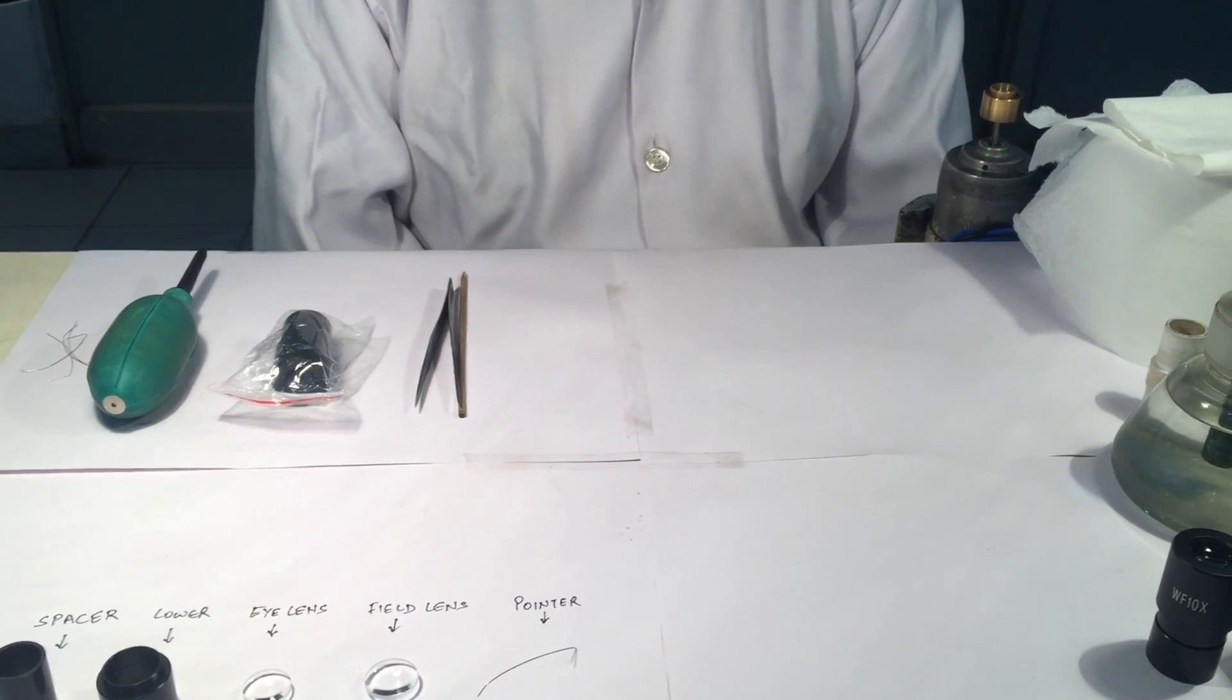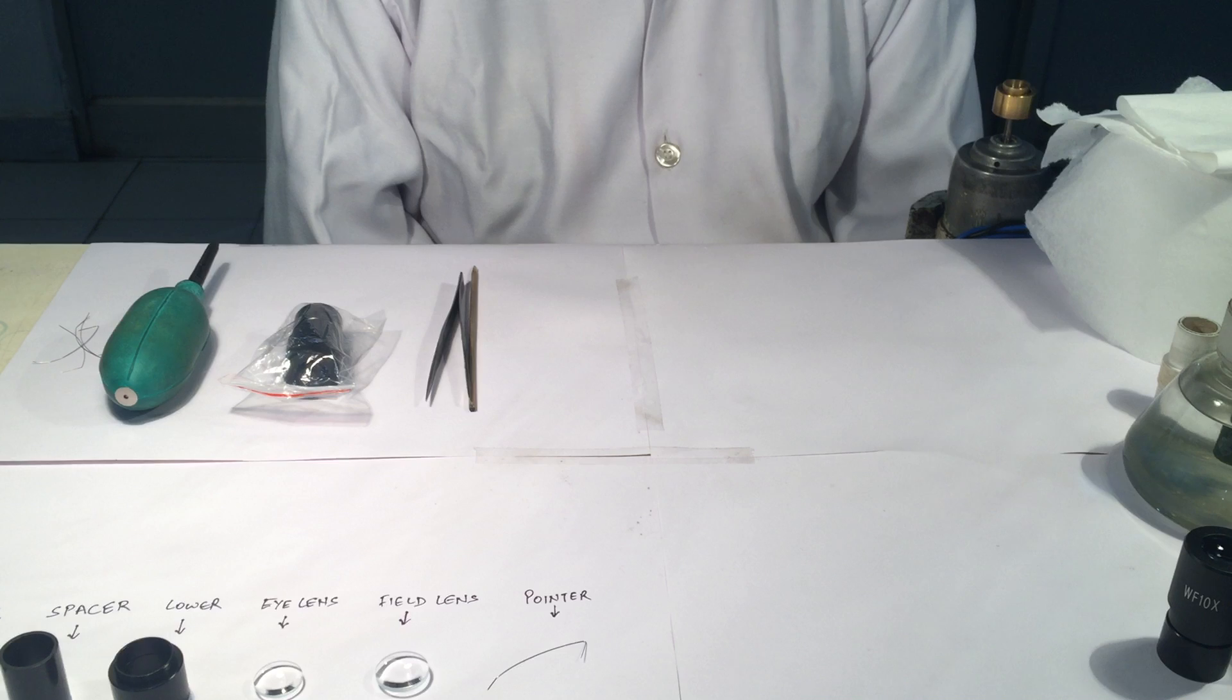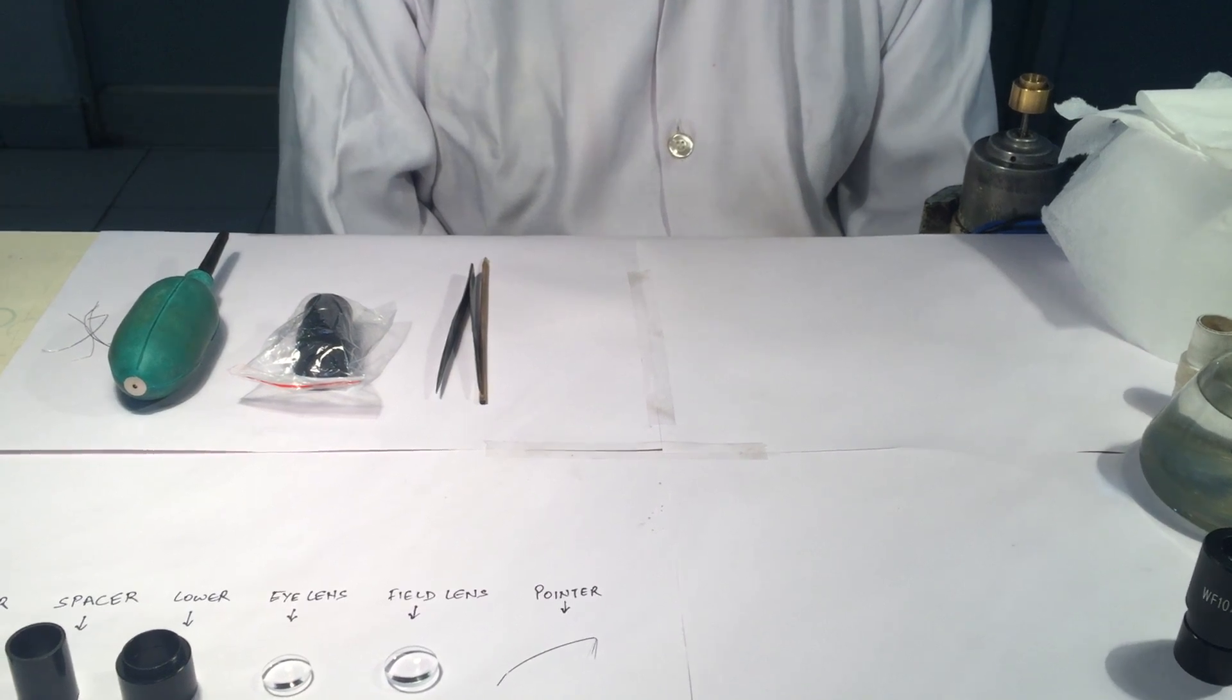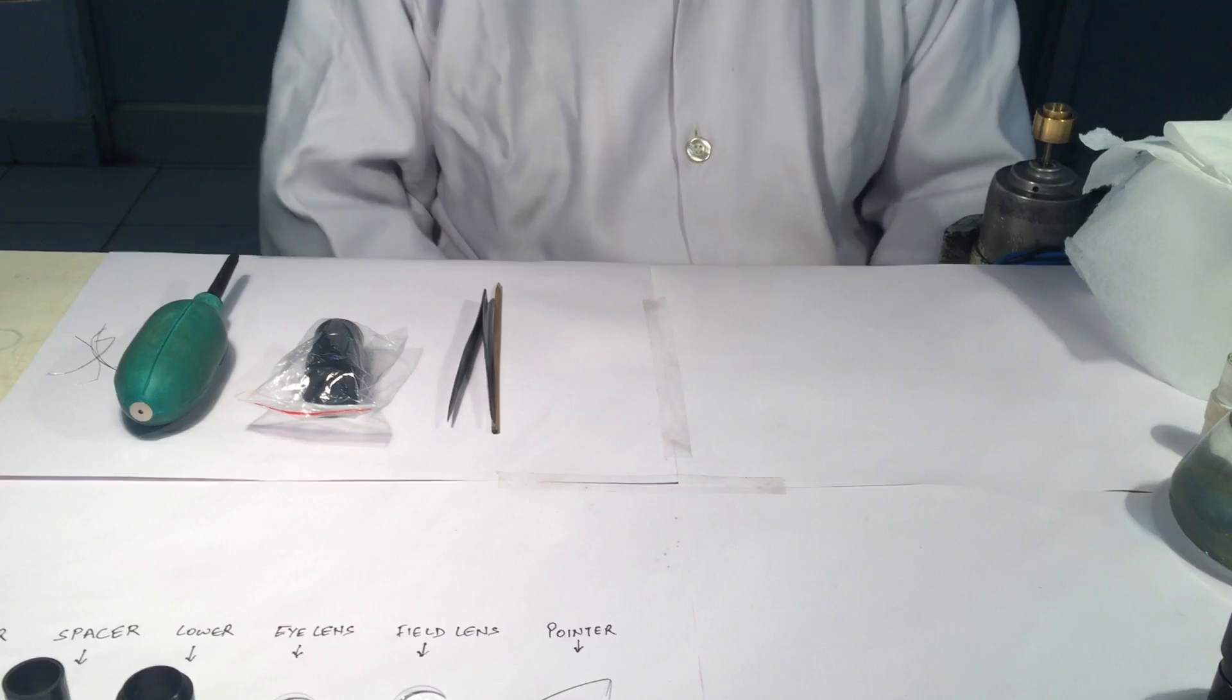Hello all, today we will show you the process of cleaning the WF10X eyepiece. Can we start the process please?